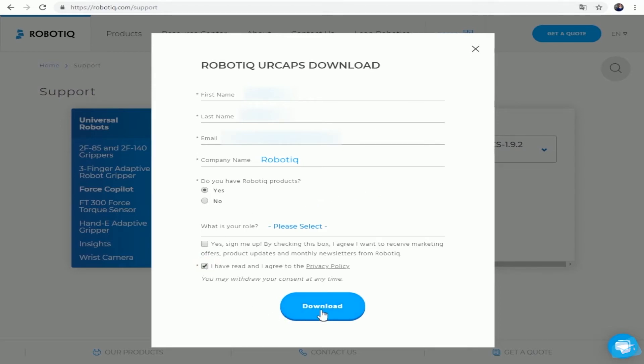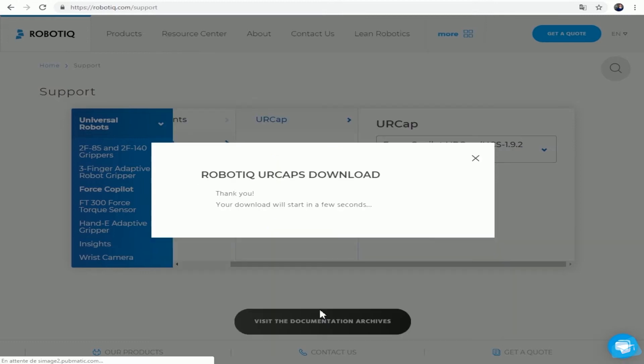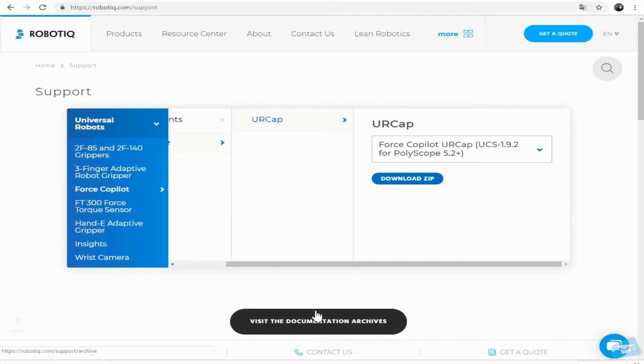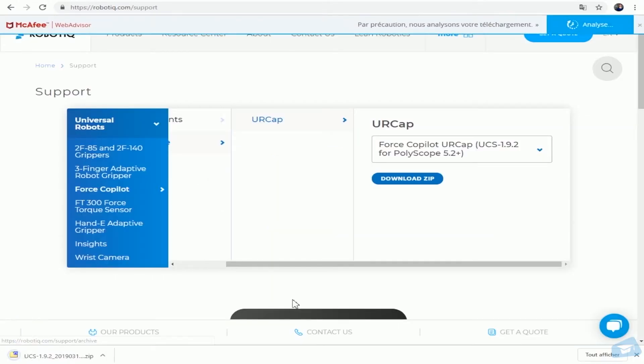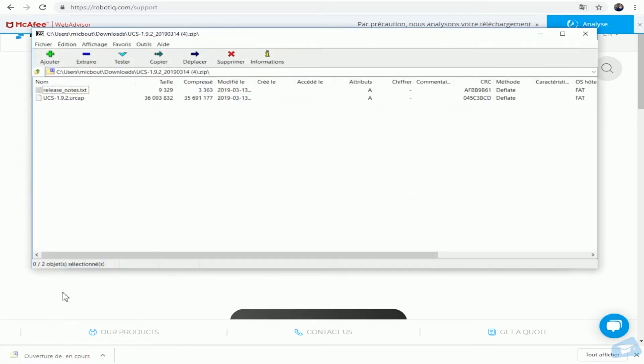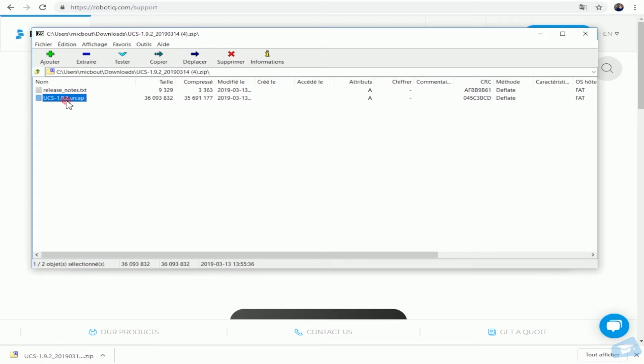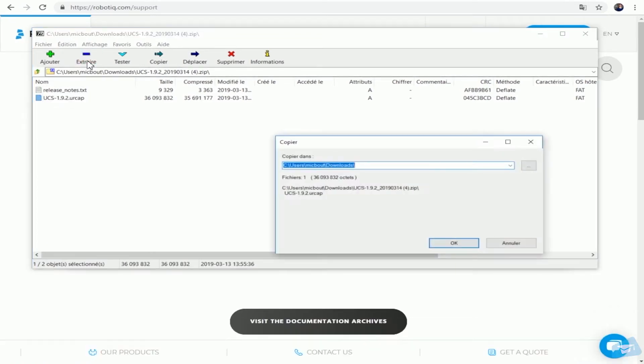In the meantime, connect the USB storage device to your computer. Find the compressed file on your computer and extract its content at the root of the USB storage device.